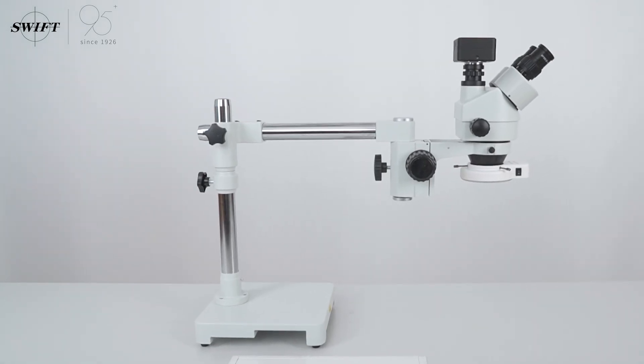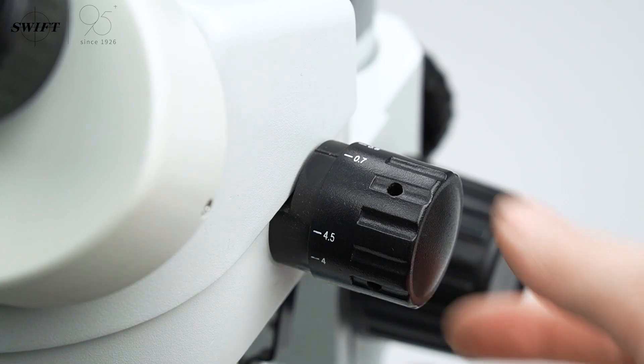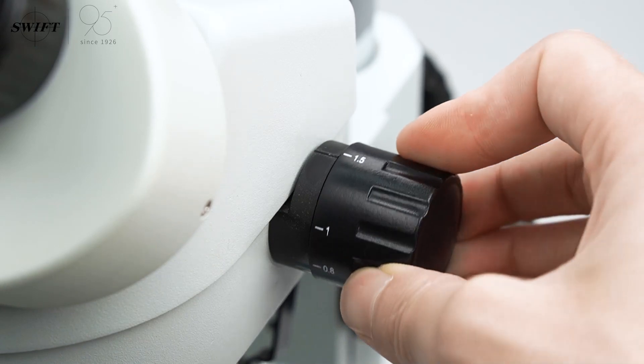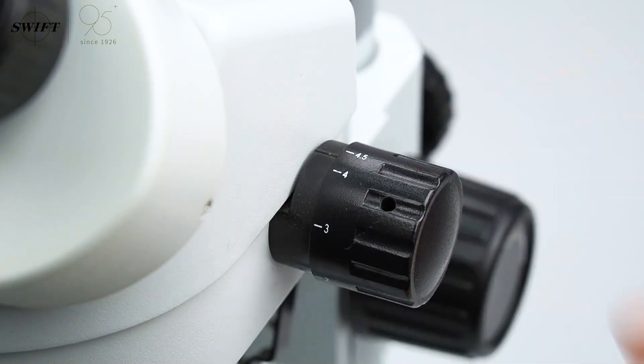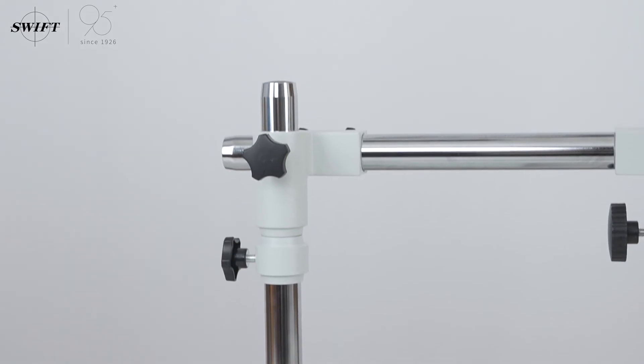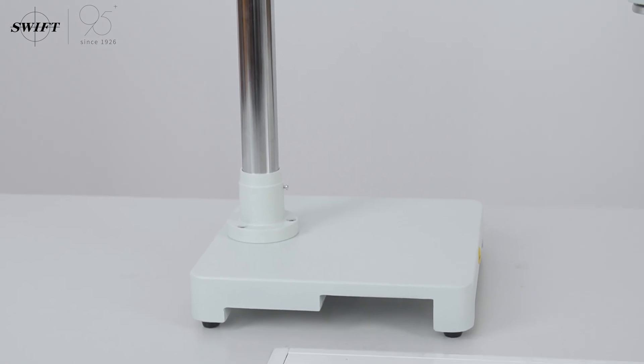This s7 ts ca05-56 continuous zoom stereo microscope has a system magnification of 0.7 to 4.5 and a zoom ratio of 1:6.4. The vertical column is the main body on which other accessories are attached, and the base is the cornerstone that supports all parts.